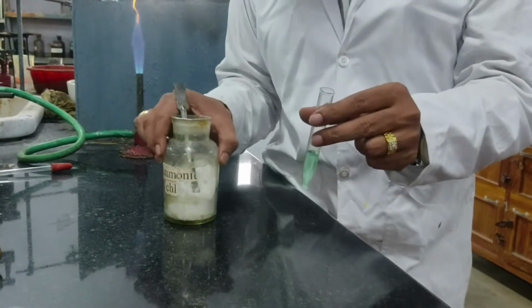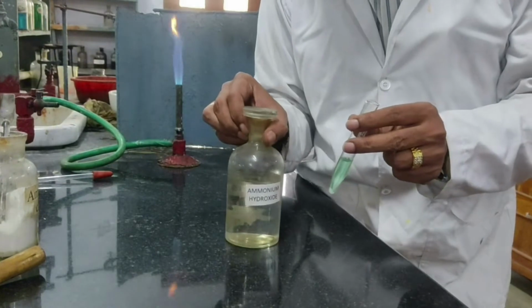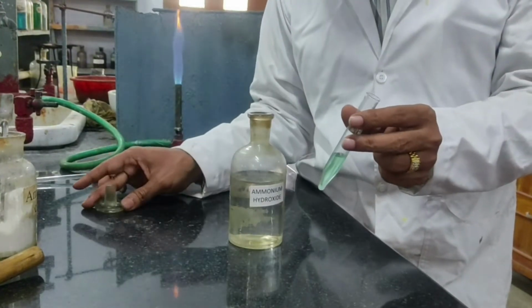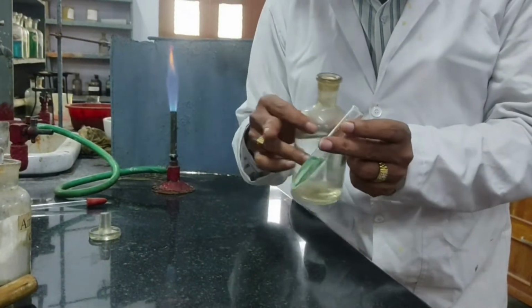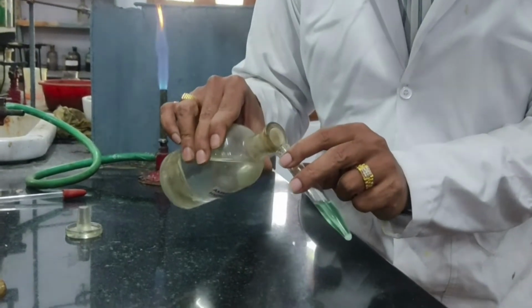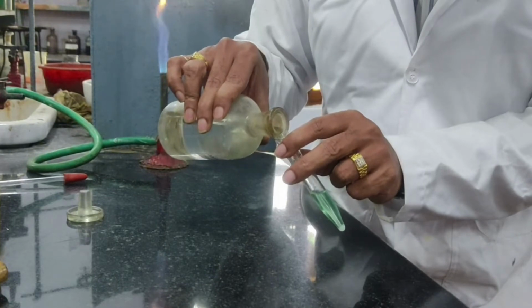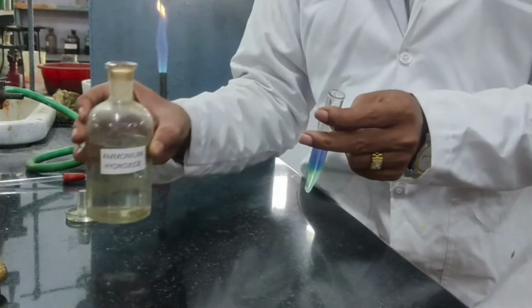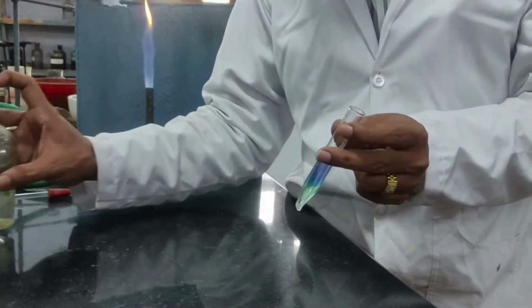Now I need to add ammonia. In the laboratory, ammonia and ammonium hydroxide are one and the same. So I am going to add a little amount of ammonium hydroxide to the solution to which ammonium chloride is already added. So I am adding ammonium hydroxide solution. Okay, now I have to pass H2S gas through this solution. I have to pass H2S gas.